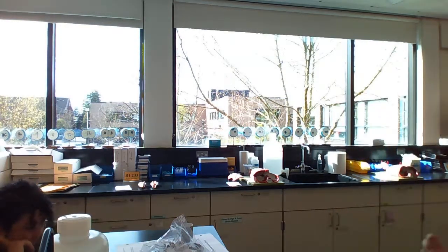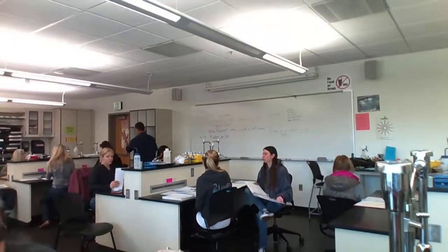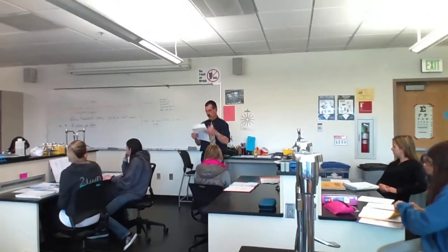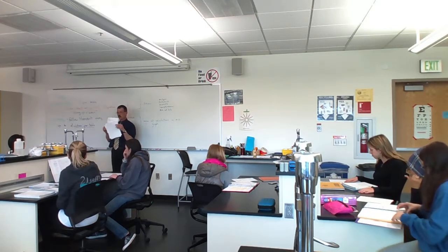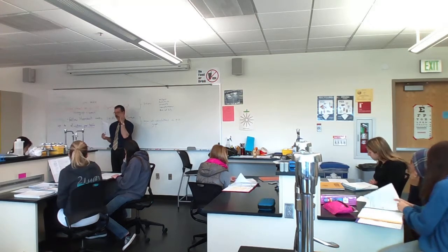This is spirometry one. I gave everyone a handout. The handout you're not turning in. It's not as though that is something I want to look at. But this lab handout replaces lab 37 in your lab manual. And what you're going to be doing is following the Vernier software that I put on your table. So if you remember last time we did the EKGs, it was Vernier, that's what we're doing again.